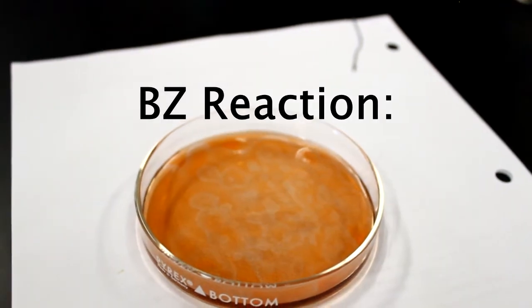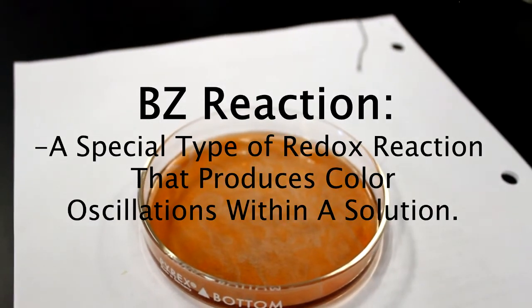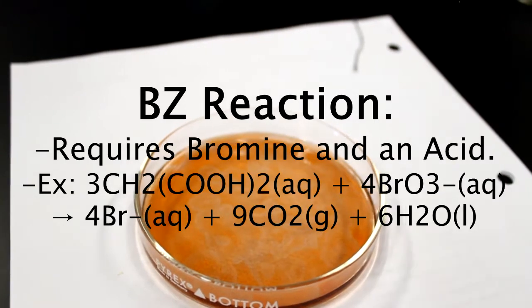This is the BZ reaction. There are many different ways and recipes to cause the oscillations. The only constants are bromine and an acid.